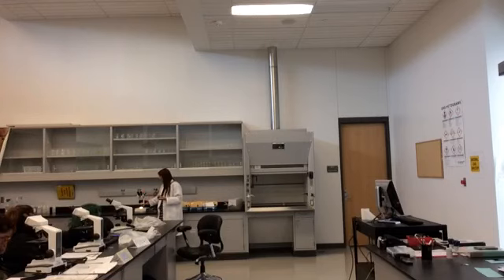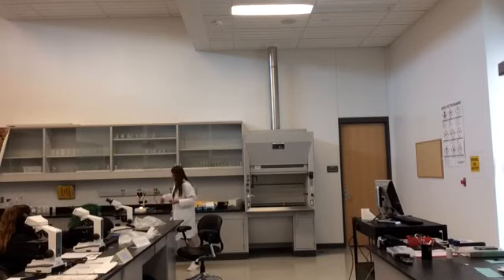It only has the coarse adjustment to move it closer to your specimen. So this is a dissecting microscope. Please don't come over here with your microscope slides. Okay, I see a lot of students do that, especially during the lab. They bring their microscope slides in, and they're like, I can't see anything. Yeah, because you can't. This is used for stuff that's macroscopic. All right?